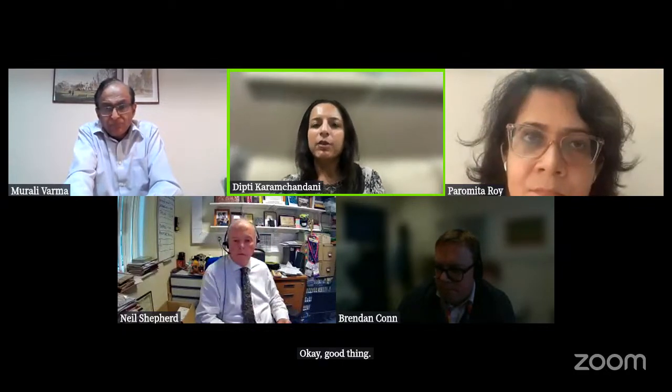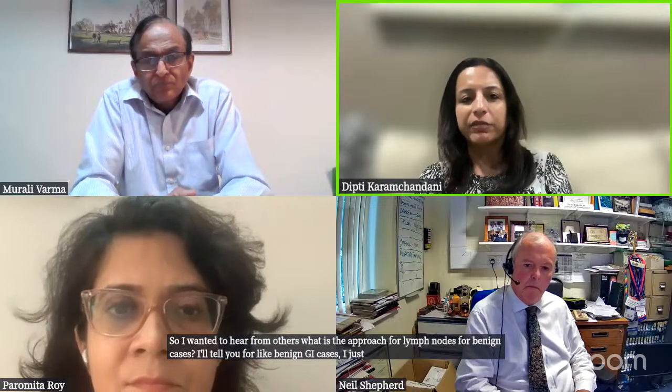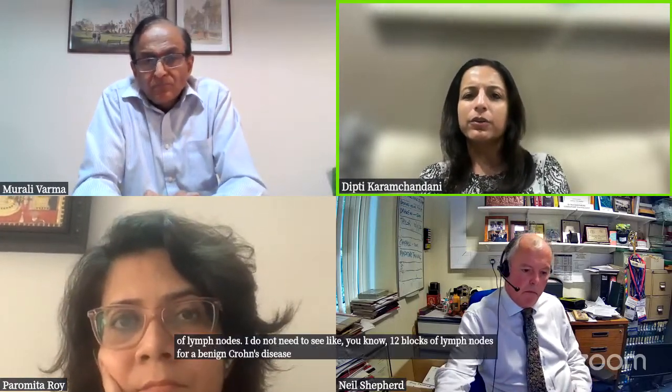Okay, Dipti. So I wanted to hear from others, what is the approach for lymph nodes for benign cases? For benign GI cases, I just say to submit 1 block of lymph nodes. I do not need to see 12 blocks of lymph nodes for a benign Crohn's disease. Absolutely. What do others do? Yeah, I don't ask them to go hunting. Whatever pops up, sample. And when sectioning, if there's something different or necrotic or something that catches the eye, then sample that.